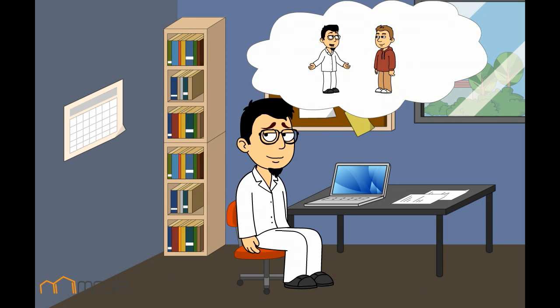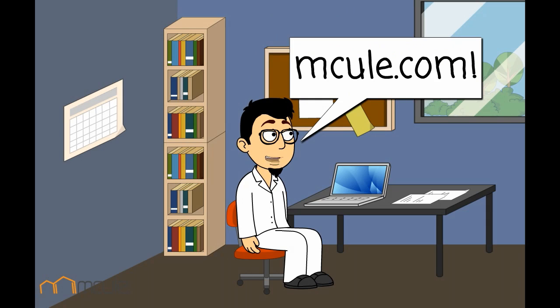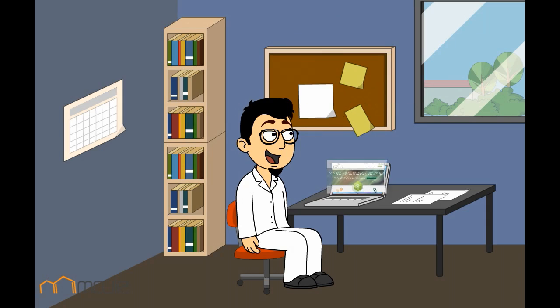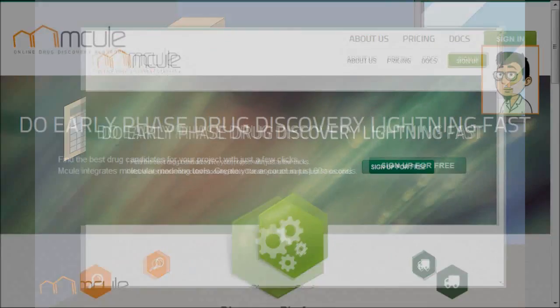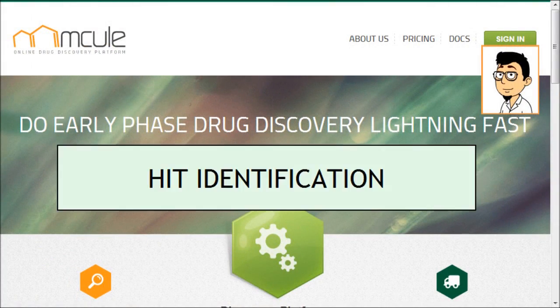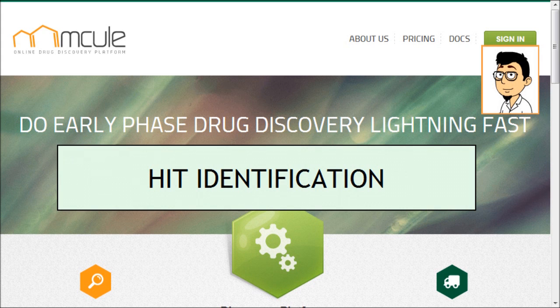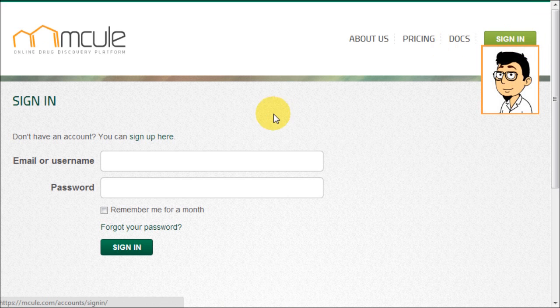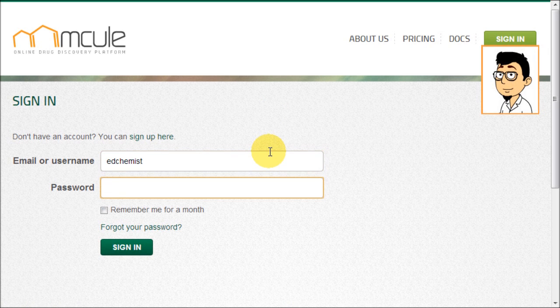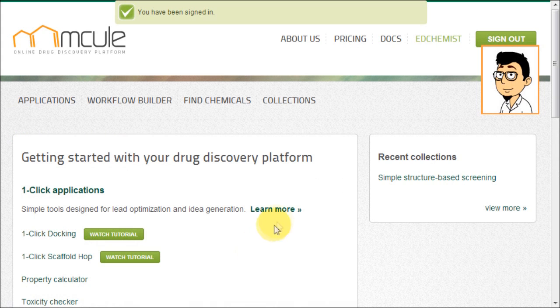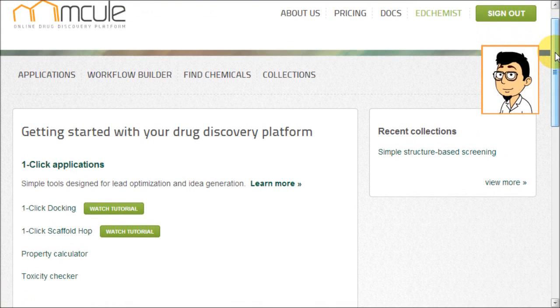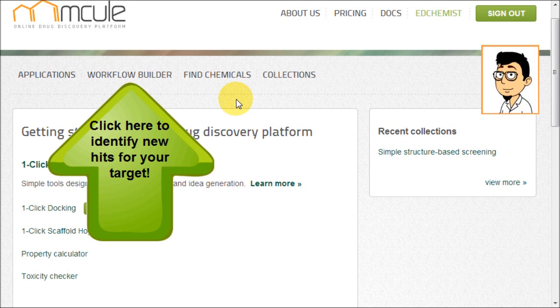Hey, that sounds interesting. Let's check out mcule.com. Hit identification. Click here to identify new hits for your target.